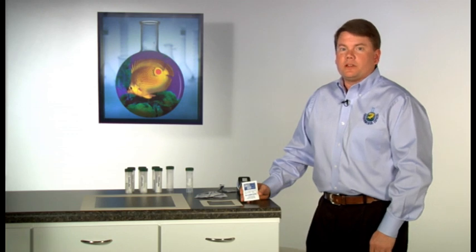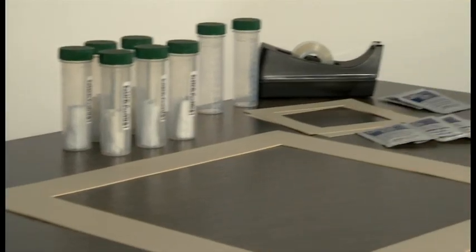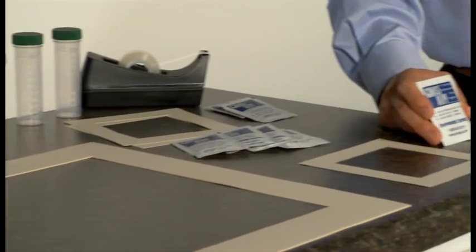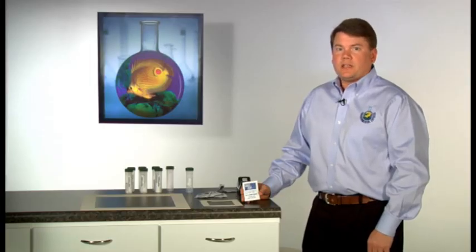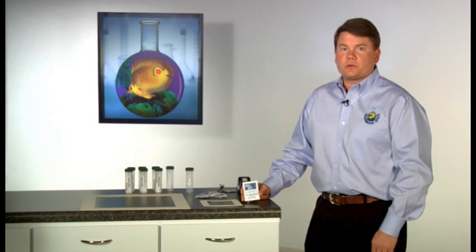The GoSwipe is the only wipe available that is designed to completely dissolve during the digestion procedure. At the laboratory, analysts add appropriate acids and heat according to their digestion procedures.